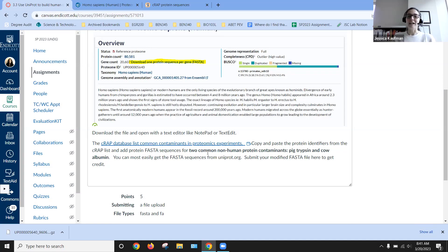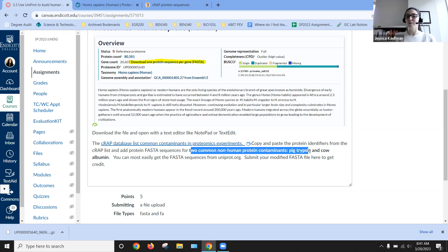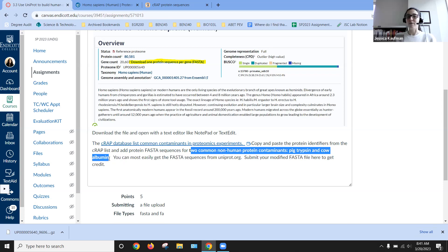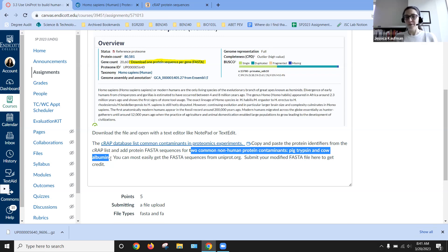And we are going to copy two common non-human protein contaminants. So pig trypsin and cow albumin are really common proteins that you see just because they're going to be used in the lab during the experiment.